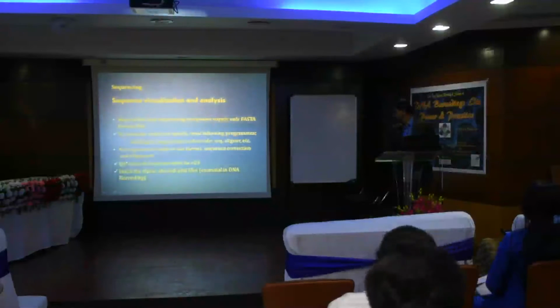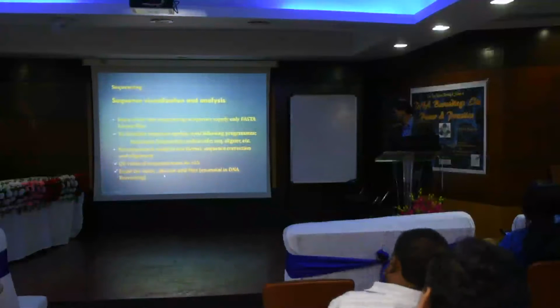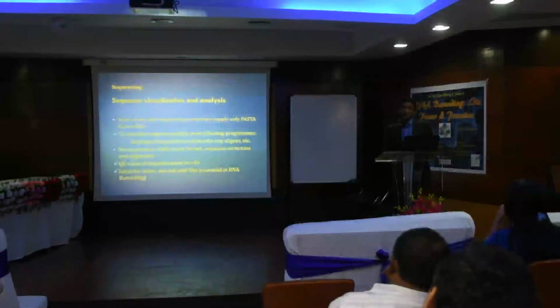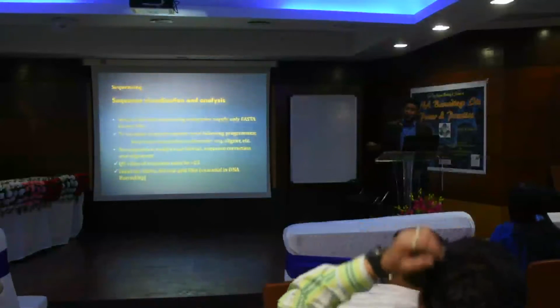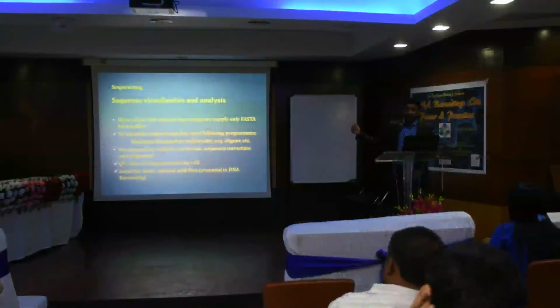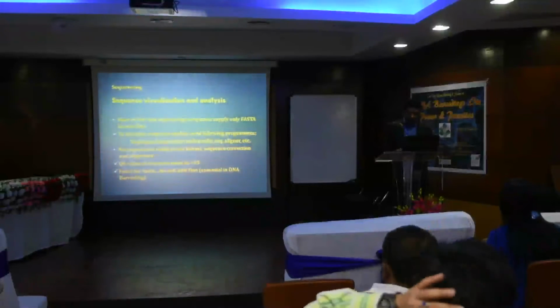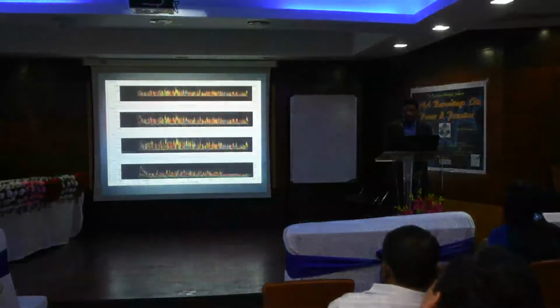Then insist on .ab1, .scf and PDF files. If you are sequencing on other, older sequencers, from the earlier days, there you will have different file formats, so that you can go and upload and verify, because they do not have the same things. For DNA barcoding projects you need to have that.